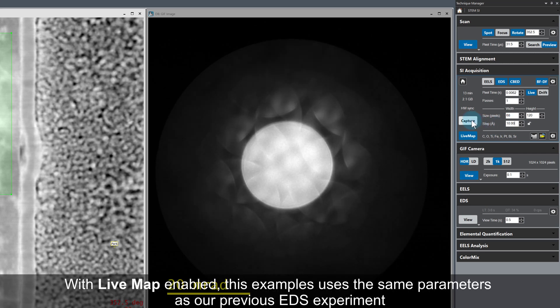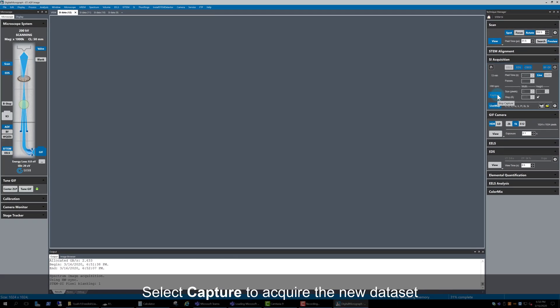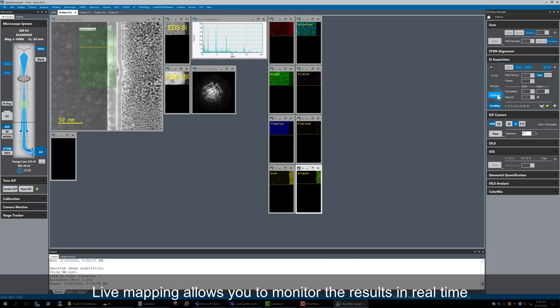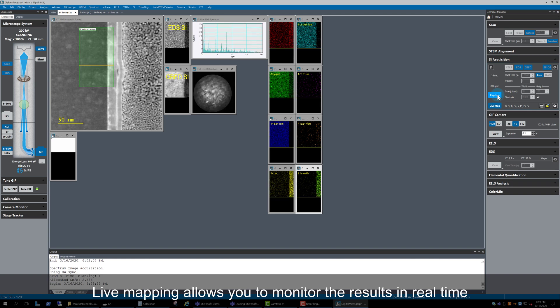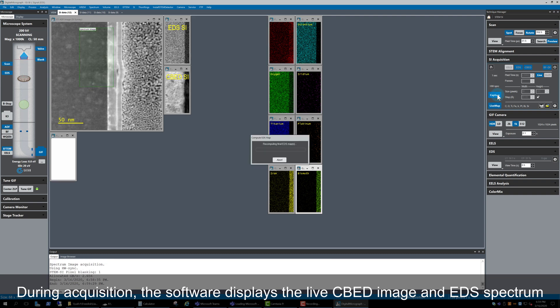Live map is still enabled. I want to use the same EDS mapping parameters as we used previously, so I won't make any changes. All that is left is to click capture and acquire the new data set. Just as before with EELS and EDS, live mapping is a great way to monitor the results in real time. The software is also showing the live CBED image and live EDS spectrum as the spectrum images are captured.